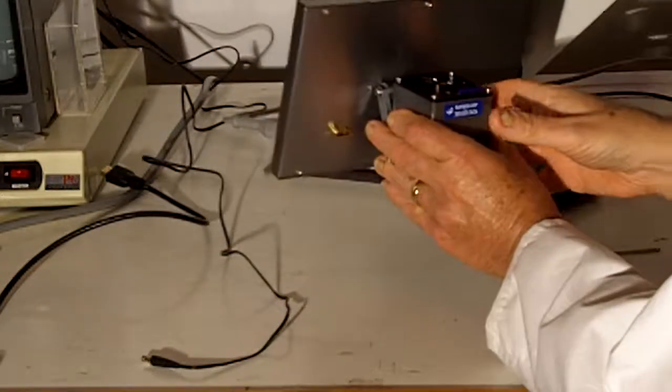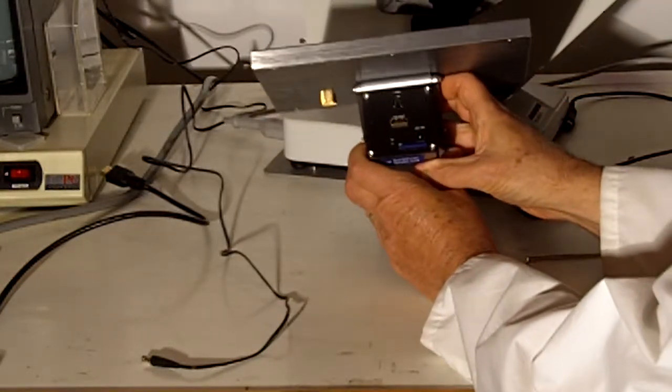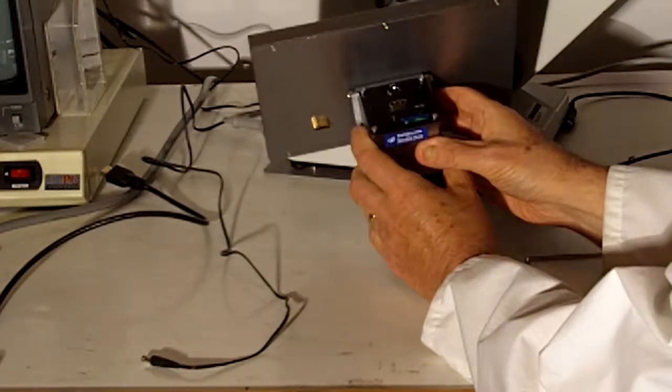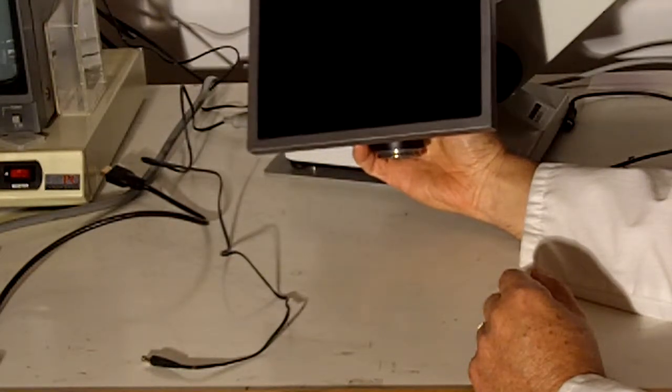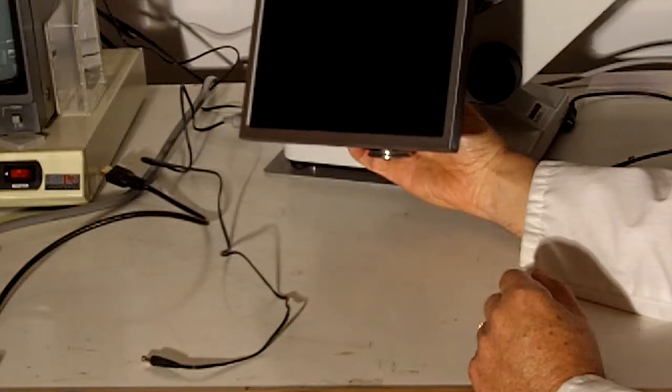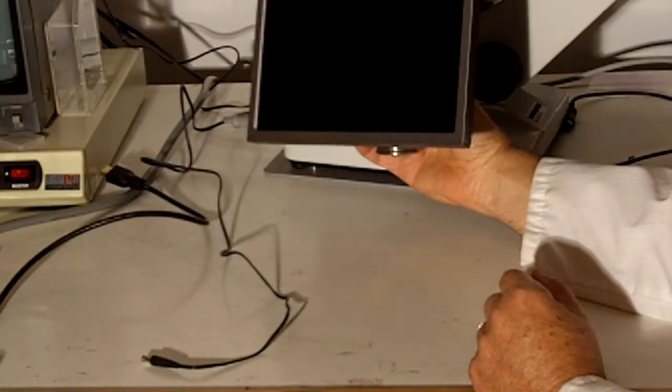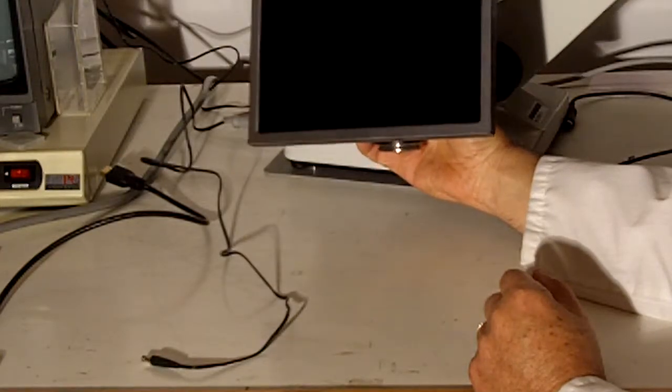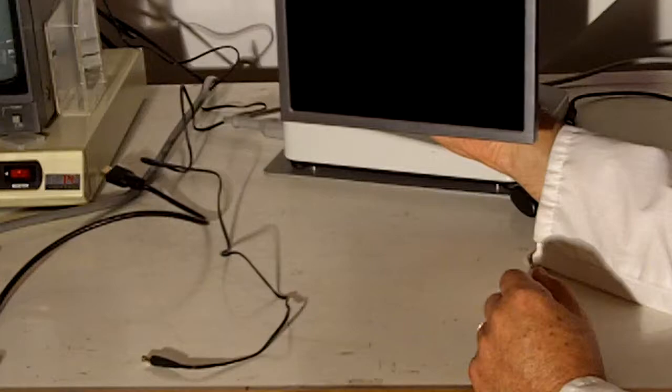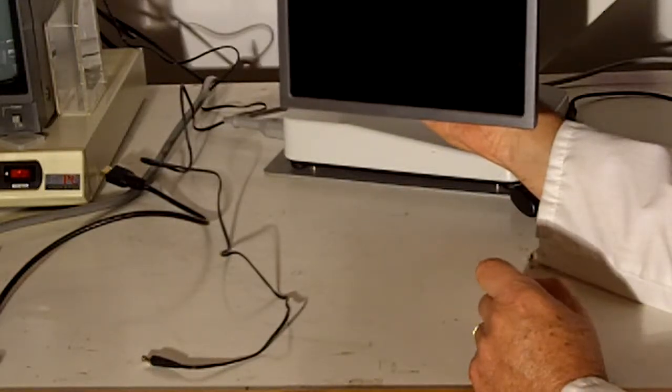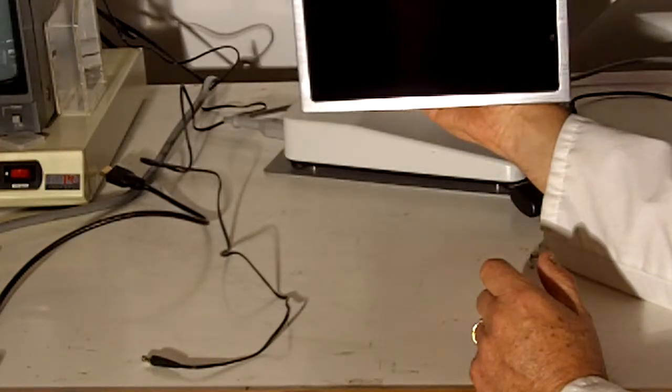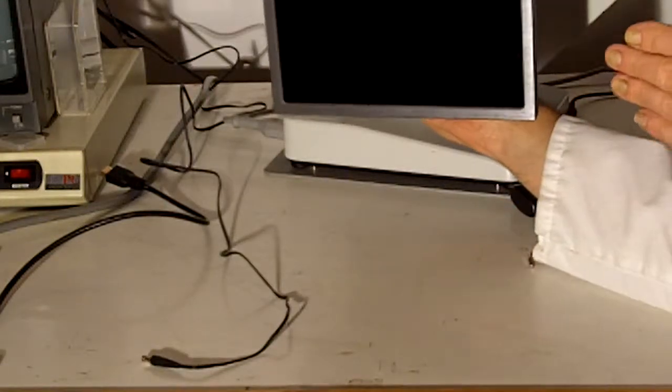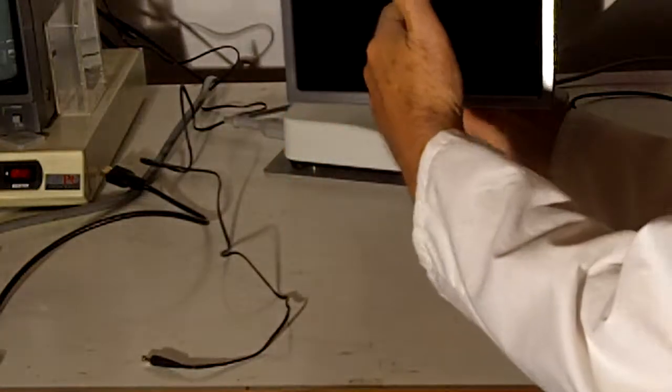This is the 9015 CMOS color digital camera with WXGA performance directly onto a 10-inch diagonal TFT screen. TFT screens are ideal not only for their high-quality images, but also because when you view these screens, unlike normal LED computer screens, the brightness does not change. It has a very wide acceptance angle so that people viewing at extreme angles will see the image just as brightly as someone looking straight on.